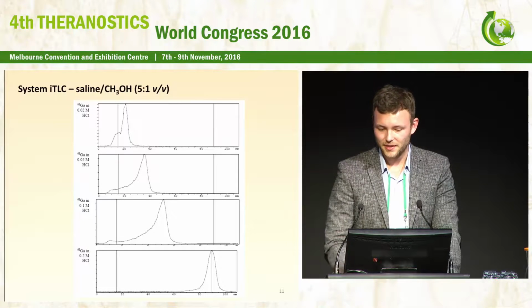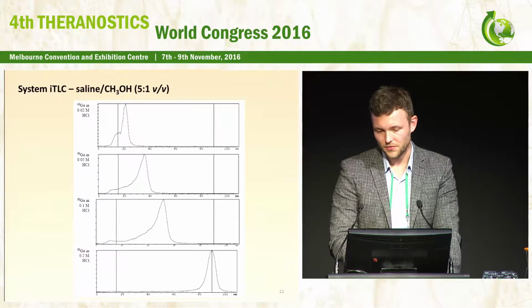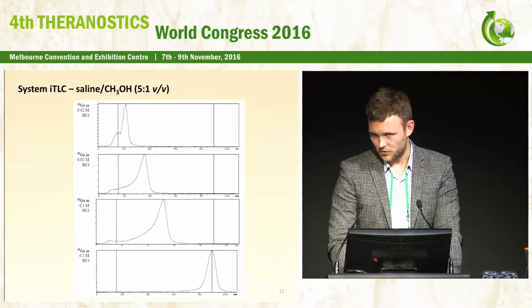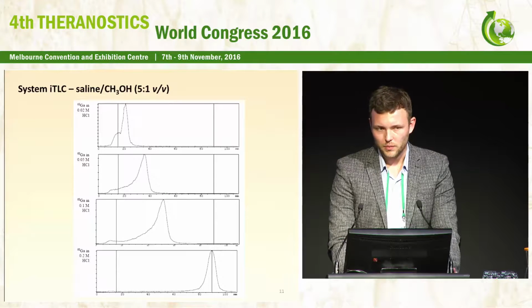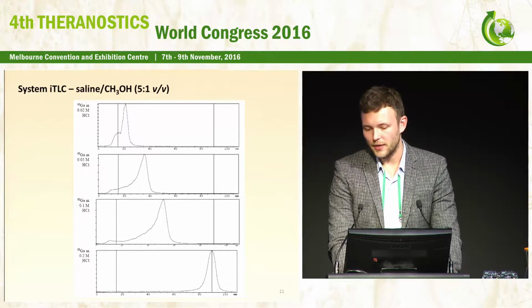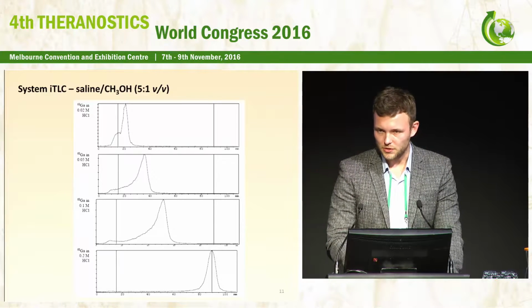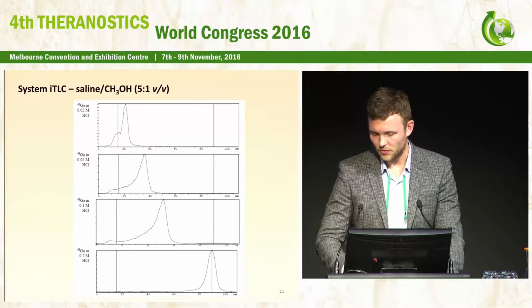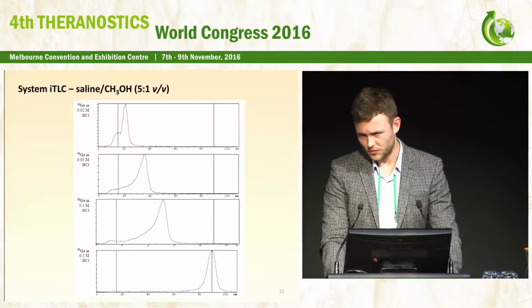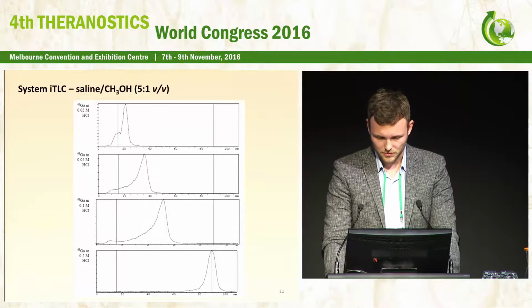But in the pH range or concentration of the radiopharmaceuticals, the free gallium will stay at the origin of the chromatogram. So what I want to say here is that the generator eluate is not a very good reference to determine the position of free gallium in your radiopharmaceuticals when you try to develop or test chromatographic systems.